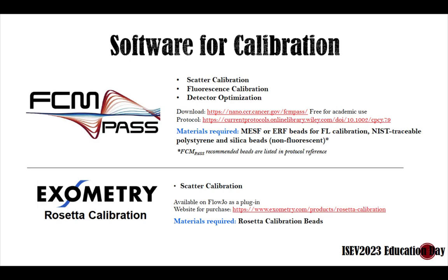The other is Rosetta Calibration, which also does scatter calibration, and the nice thing is I believe now there is a FlowJo plugin for it, right? Available now. So if you guys are used to using flow cytometry for cells, you should know what FlowJo is, or at least have heard of it. And the materials required are listed on the website and also here.